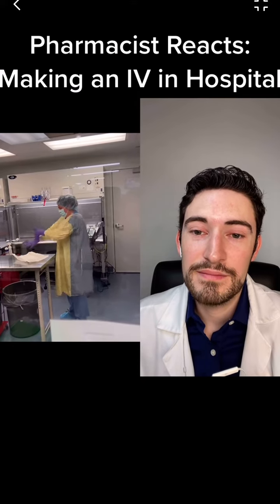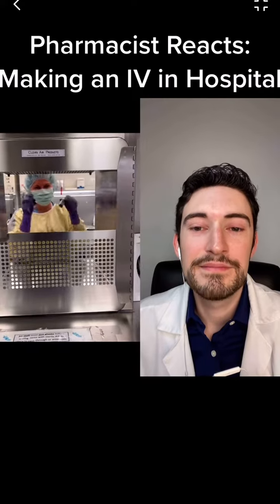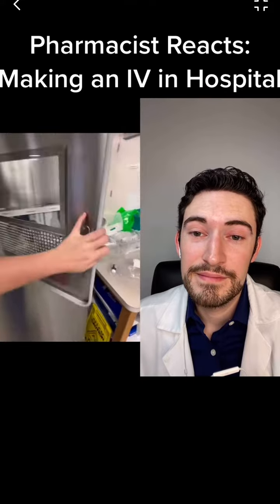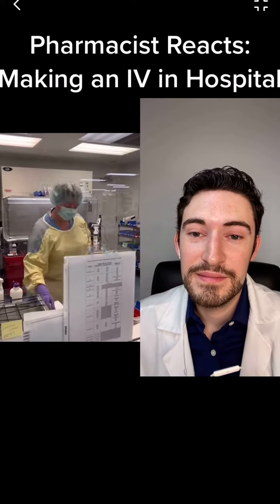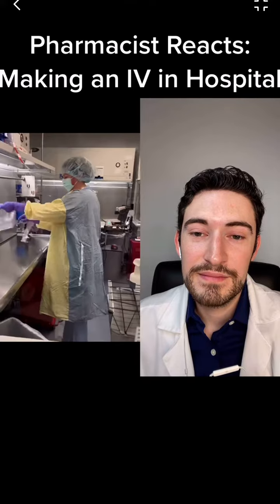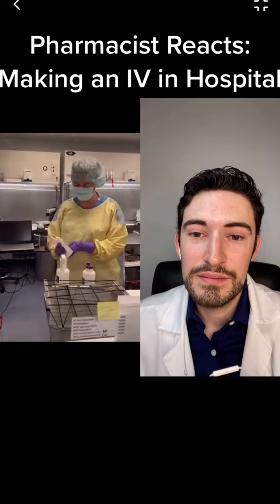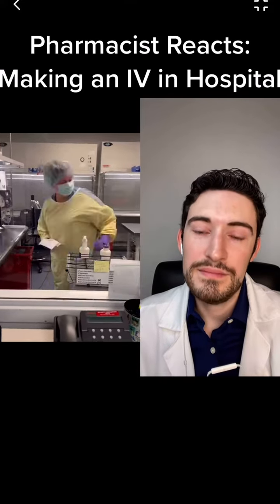After we've put on our sterile gloves, we can go ahead and grab what's been passed in to us. Then the tech is going to grab us our label so that we know what we're making. Okay. I'm going to look at the label, figure out what else I need so that I can make that medication, grab all of my items, get it all wiped down and put into the hood so that everything is nice and sterile. Wiping everything with alcohol before it goes in.